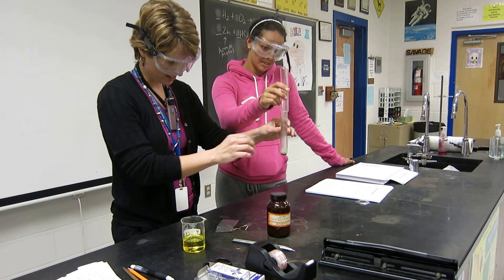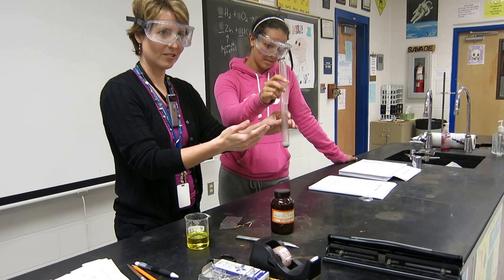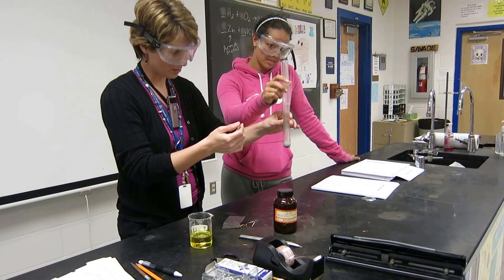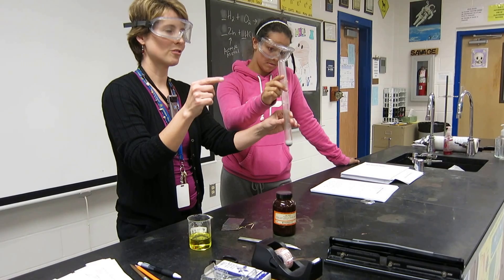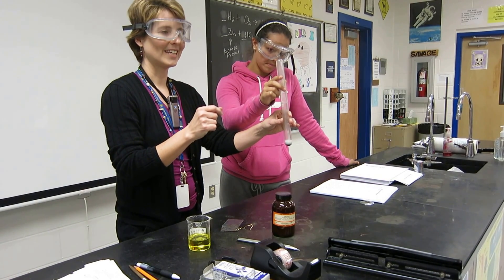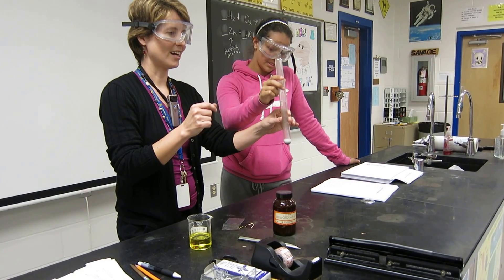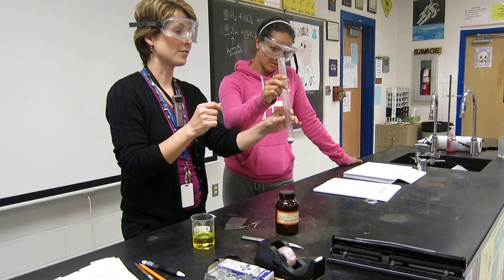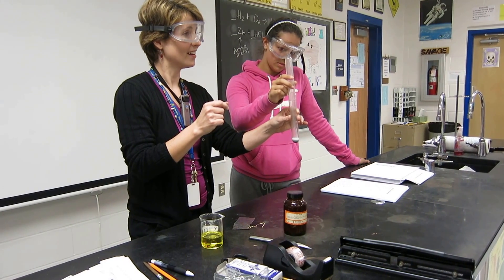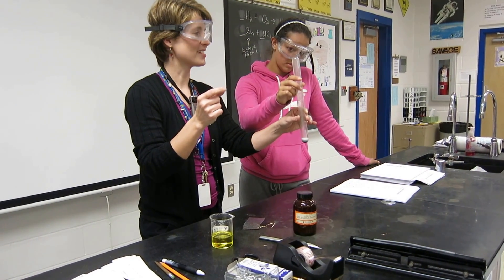Because what do you see down here? Bubbles. Okay, so what kind of gas do you think is being produced in this reaction? Remember, it's zinc with hydrochloric acid. What kind of gas do you think might be produced here? It's a very lightweight gas — atomic number one. Hydrogen gas.